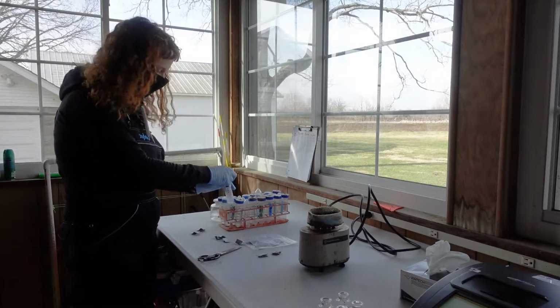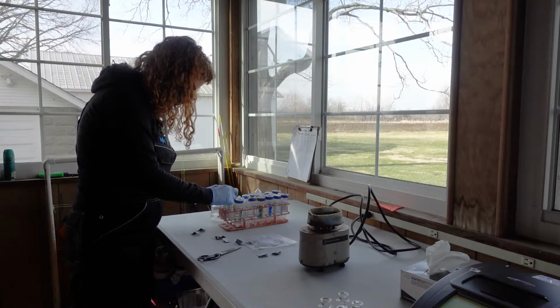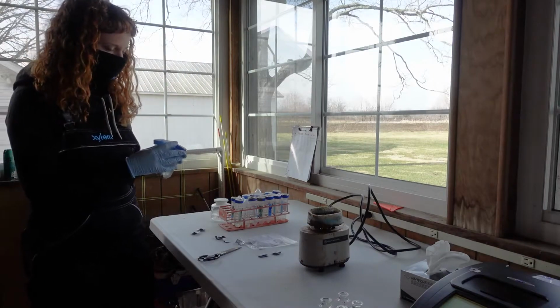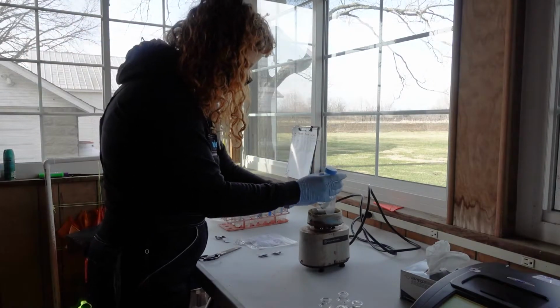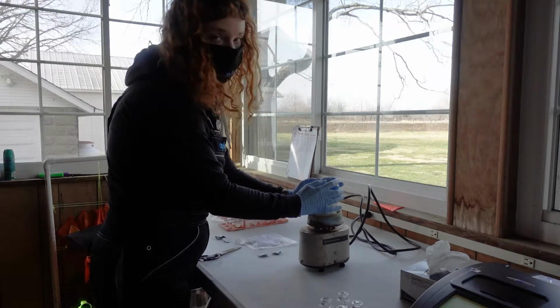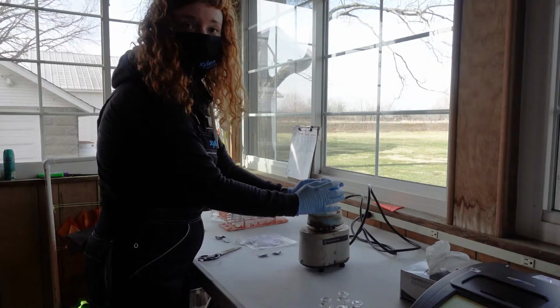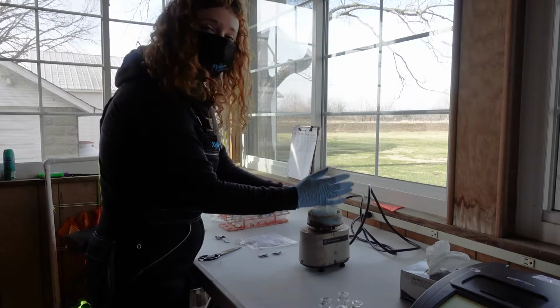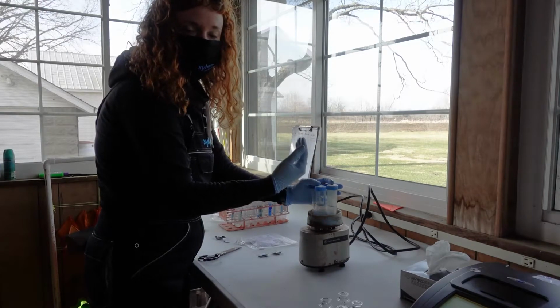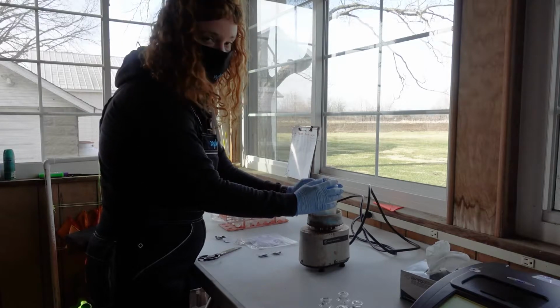All right, so you filled your last tube. We'll replace the cap. We'll take 4 tubes at a time. They all have reagent in them. We'll place them on our vortex machine, hold them together, and then press down. This will get kind of loud. What it's going to do is shake the samples up. It's going to create a vortex in all of the tubes. We'll do that for 1 minute, so you'll want to set a timer once you start this vortex.